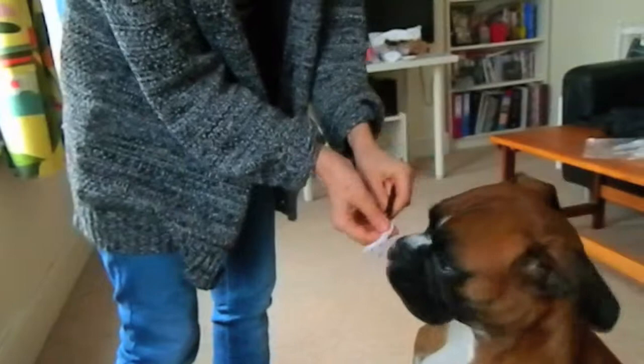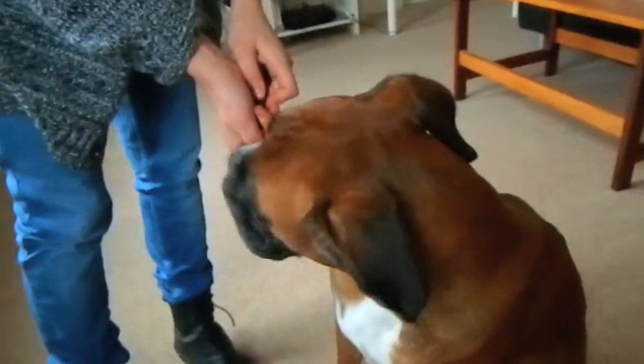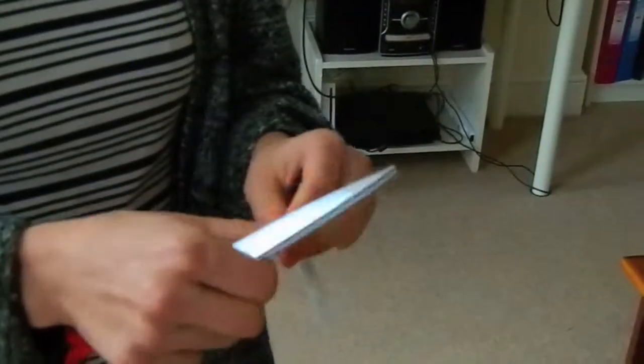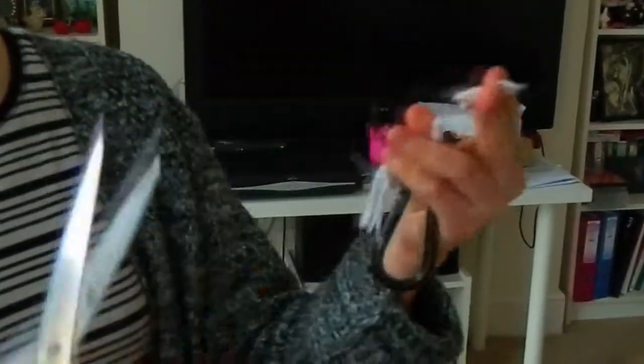Good girl. Once you've got the rope as soggy as possible — as soggy as you possibly can — take the soggiest part, which I would say is here at the end, and cut that off, like so.